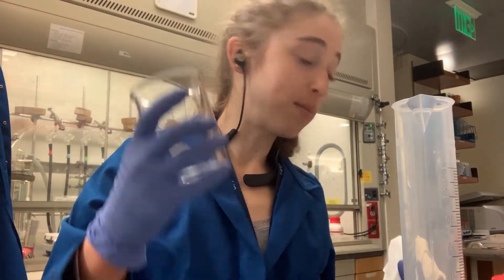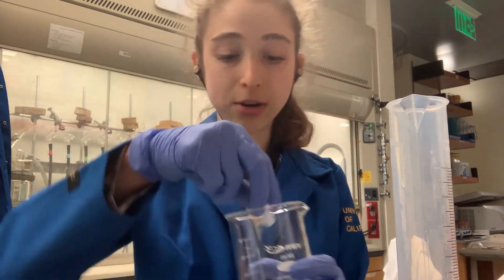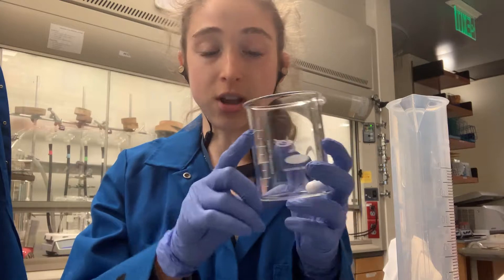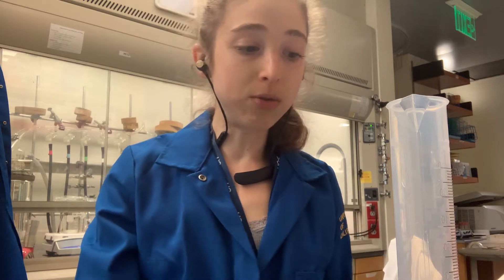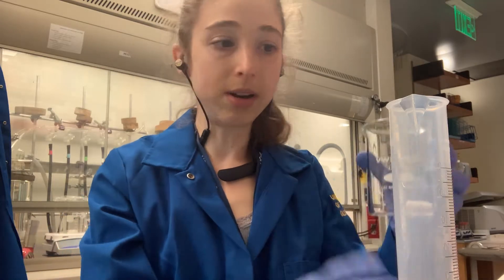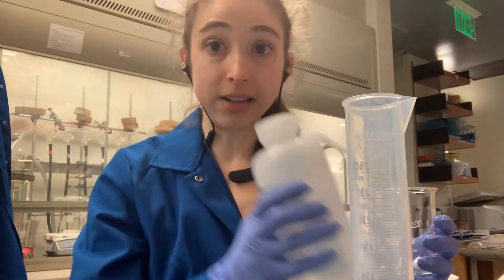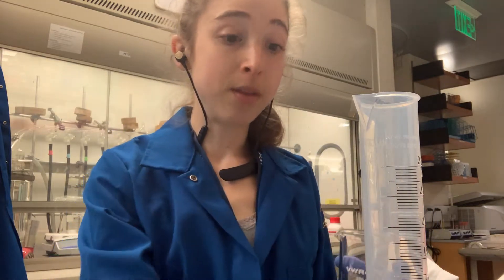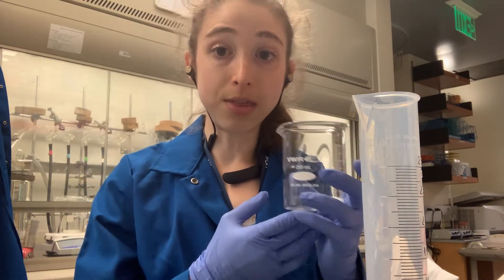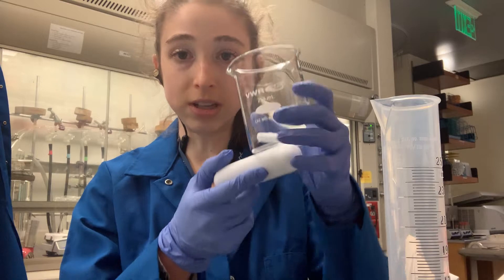When you're making a solution, you're going to be making it in a beaker. Stick your stir bar into the beaker with a little bit of liquid, and then add your solid to that. You're going to be adding about three quarters of the liquid for most things. When you go to transfer from the beaker to the graduated cylinder, make sure you're removing the stir bar first, or at least holding it on the outside.